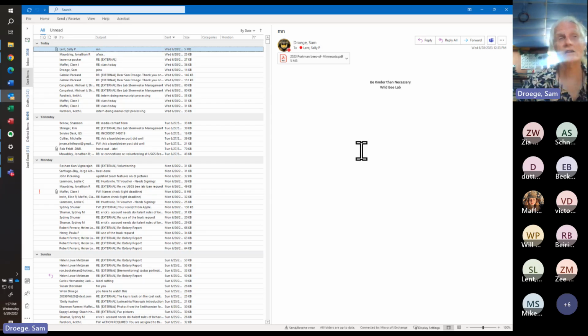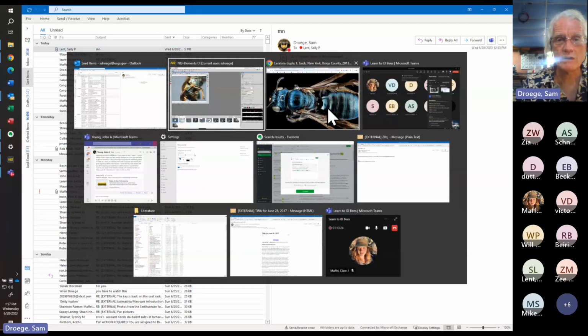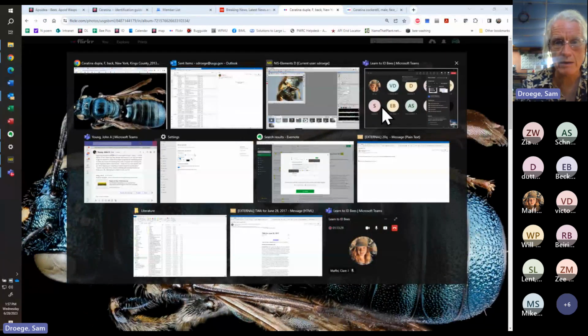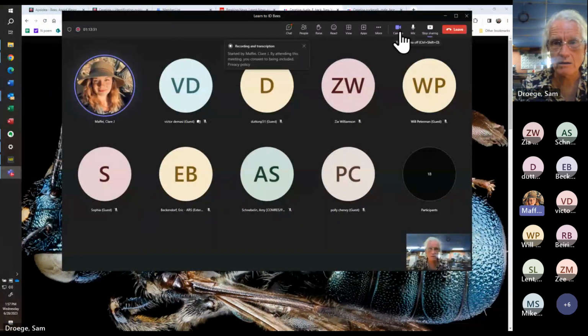Like I know it's a Ceratina, but I don't know what it is, or sometimes it's lost in the abdomen. And other times it's more what we've been concentrating on today, which is the ambiguity of the markings on a good specimen. Trying to get back here. And you usually spend some time talking about the distribution stuff. Do we have any besides the north-south gradient for the floridana strenua situation? Do we have any east-west, or are any of your sandpit friends in here?